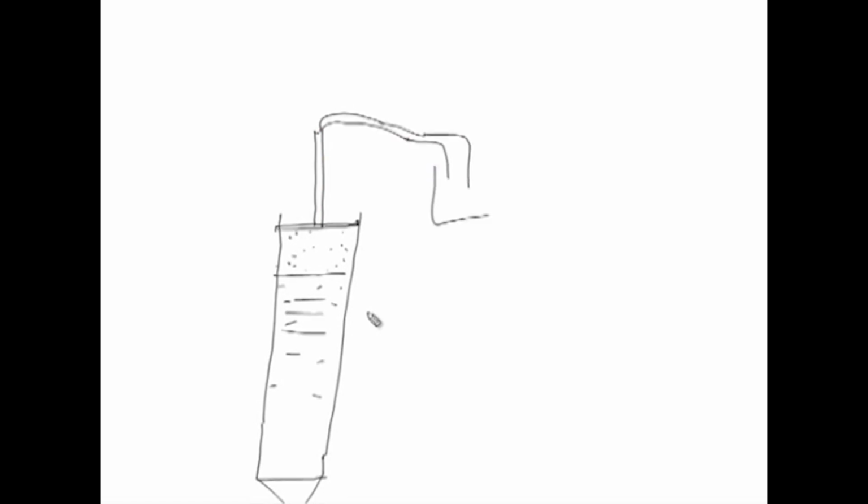So, you have the stationary phase filled in here, and you have your mobile phase here, and you will have closed it either with a plunger or with a cork with tubing in it. There will be tubing attached to your mobile phase. It may be through a pump or it may be without a pump, so you can do it either by gravity or with a pump.